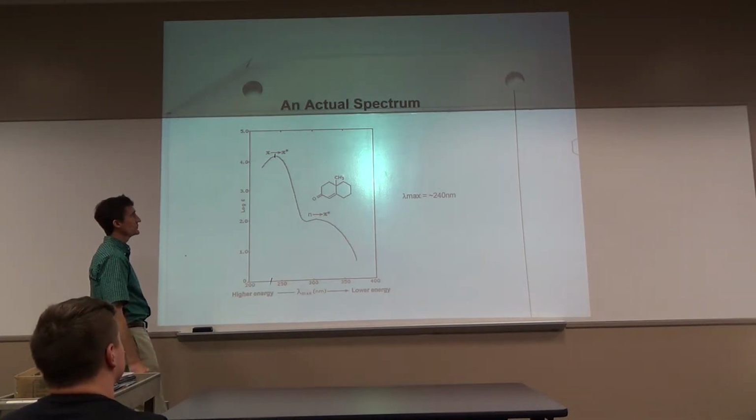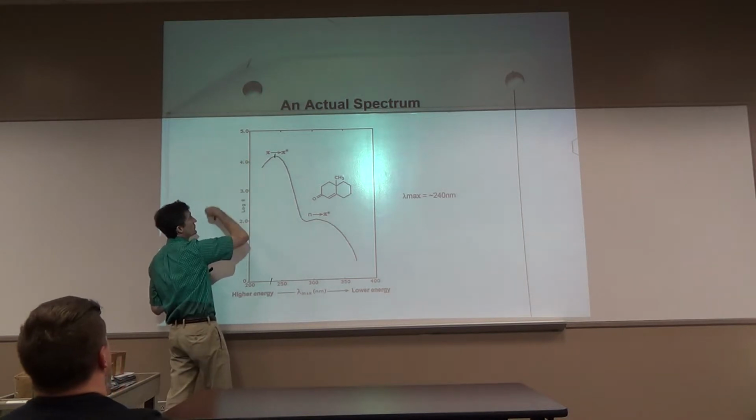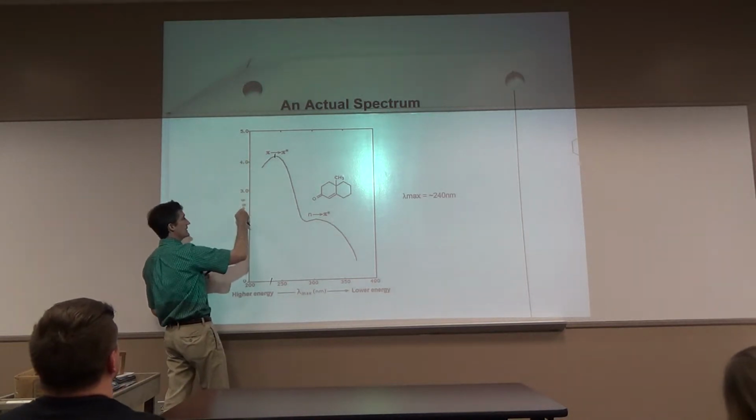All right, you can get your ruler out. That's the point of maximum absorbance. All right, this is absorbance typically. They can be plotted in various units, logs of something.